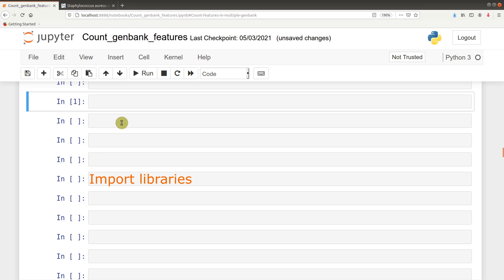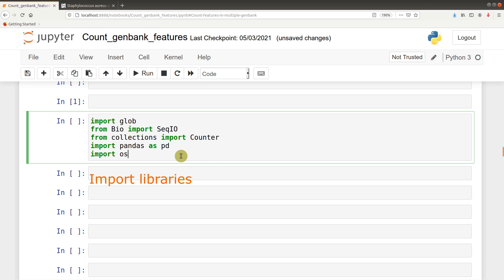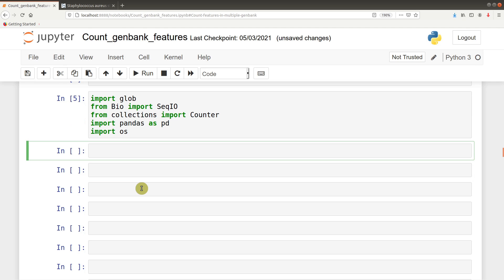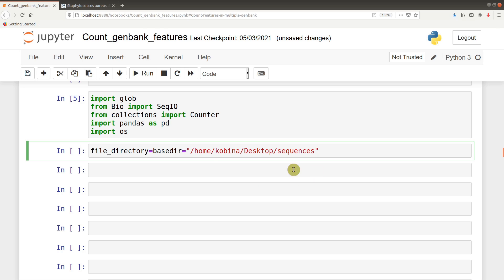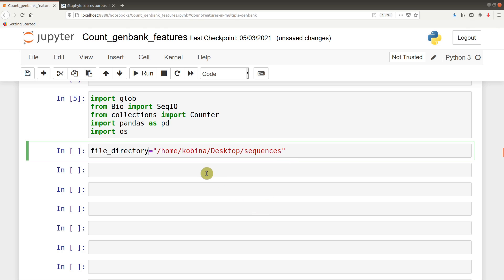First of all, we are going to import our libraries. These are the libraries we will use, then we run it. We are now going to set a path to the directory that contains our GenBank files. This is how I set my path — this is the file directory that contains your sequences. Please note that yours is likely to be different, so make sure you put the appropriate path there.